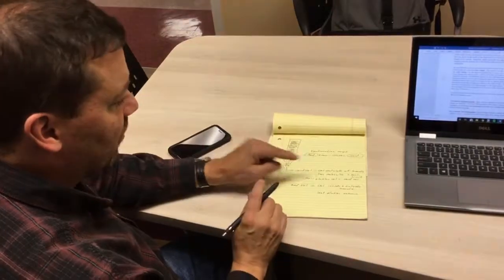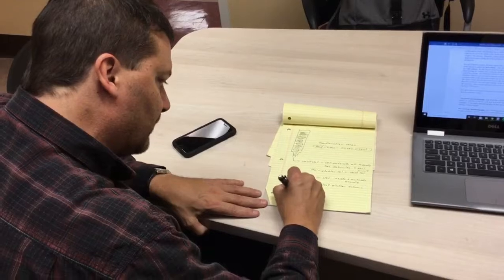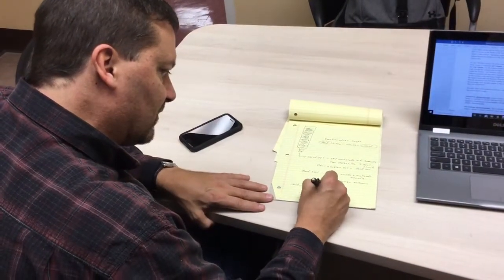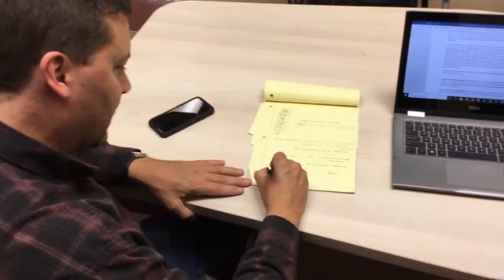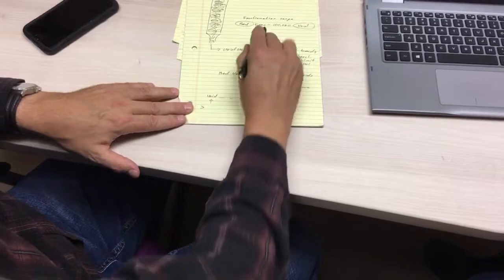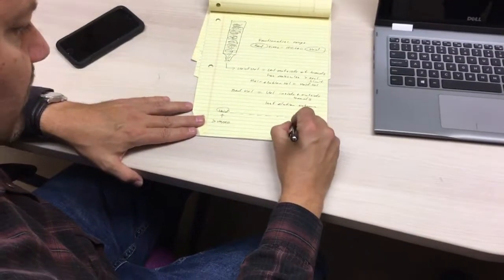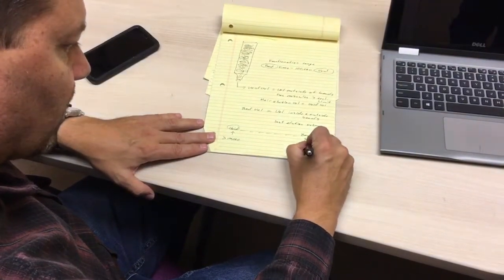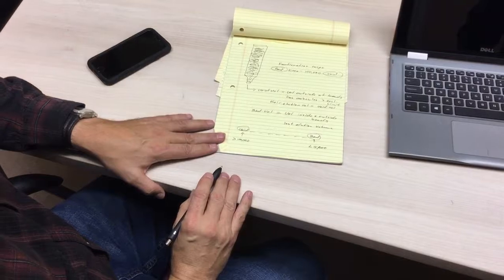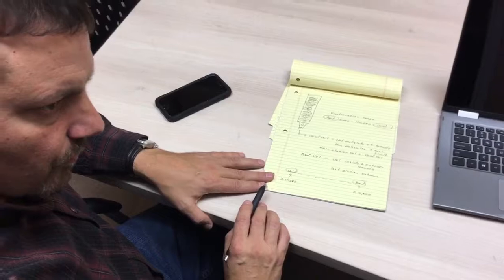Which of those comes out first? The void volume. First you have the void volume come out, then a whole bunch of fractions, and then the bed volume comes out. Anything greater than, in this instance, 100,000 is all going to come out in the void volume. Anything smaller than, in this case, 5,000 is all going to come out in the bed volume. You get effective separation in between, and that's where you can find your sample.